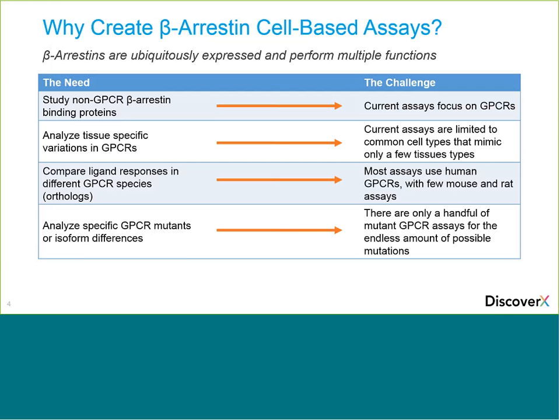All right, so next we're going to get into the tools to create your own cell lines and cell-based assays. But first, to understand the tools, there's a technology behind them that I'd like to go over in just one slide. This technology is called enzyme fragment complementation. It's used to create cell lines and assays to study protein-protein interactions and other applications, and not just specifically for our particular discussion today for GPCRs. It works on many other applications.